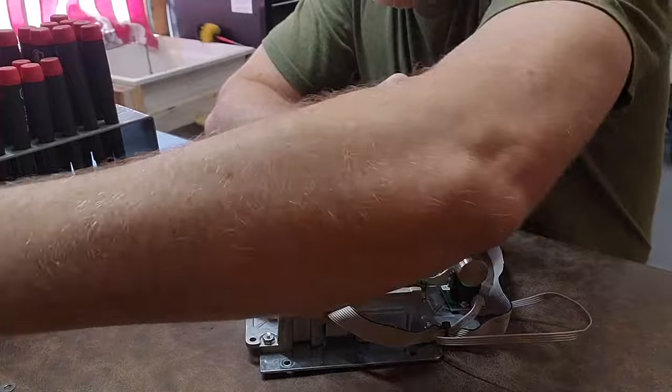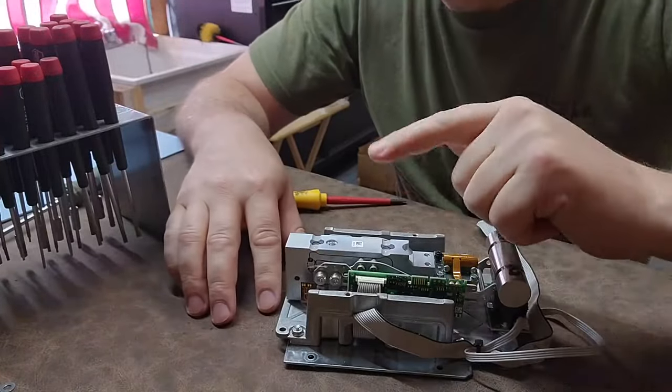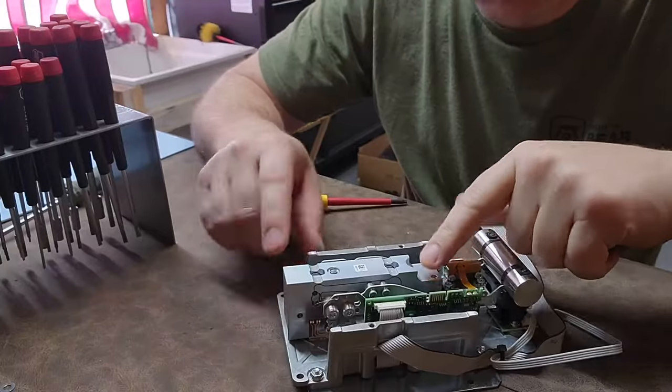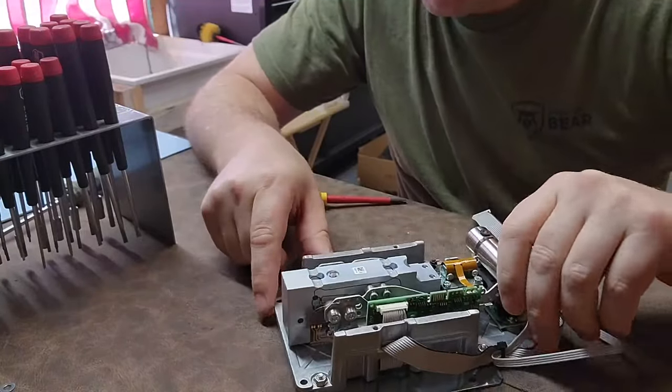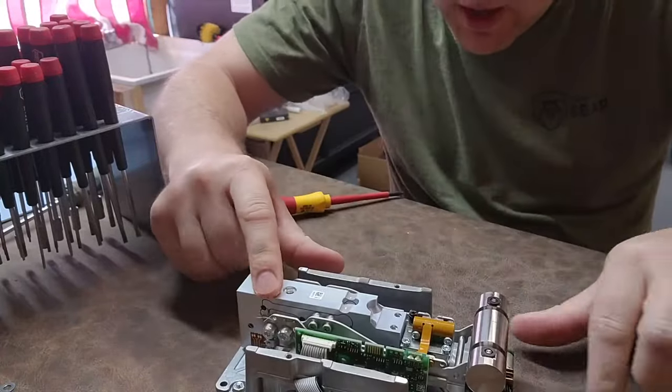There are two fasteners that place the load right over the load cell, which is this giant block of aluminum in the middle. Let's see if it still has the same traits without that tray on it.